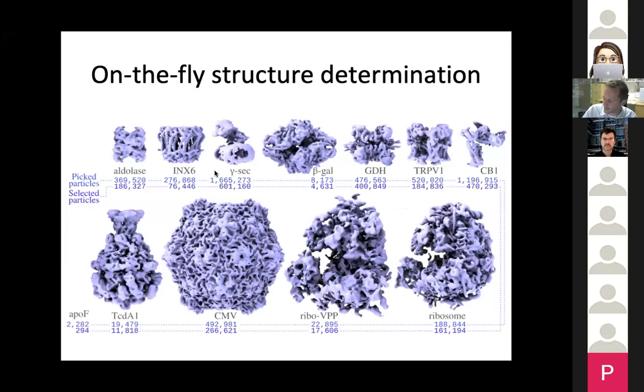So we applied this automated pipeline to those EMPIAR data sets. And these are just resulting maps for all the different structures. So all of the structures, ironically, except for apoferritin, which is a data set used for the FrealignX tutorial, which didn't go well at all. But all the other ones went well. And this was a case of very close neighbors, and the 2D class selection basically failed to select enough particles. It's a very small test data set as well.